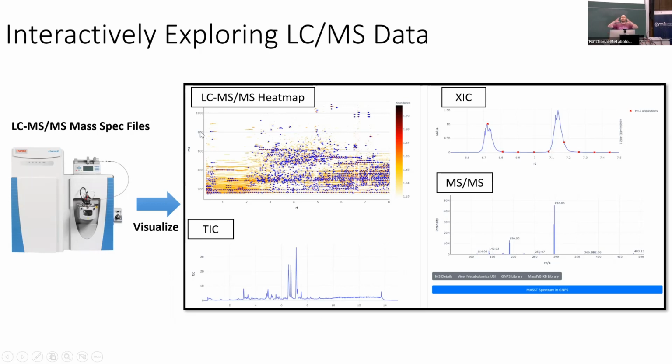That is just an overview of your data structure, right? You have m/z on the y-axis and retention time on the x-axis. With the heat map, the intensity of each of those peaks is indicated. And what you can see here nicely is these blue crosses, which indicate the position of a particular MS/MS scan.